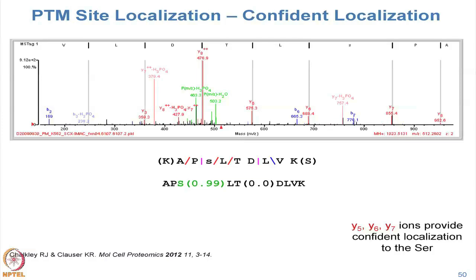They should have been labeled. Okay. This is going to be a 113 gap. This is going to be a 167 gap. And then 97. Okay. So that can place the phosphate on that serine, not on that threonine. This gap over here is going to be 101.